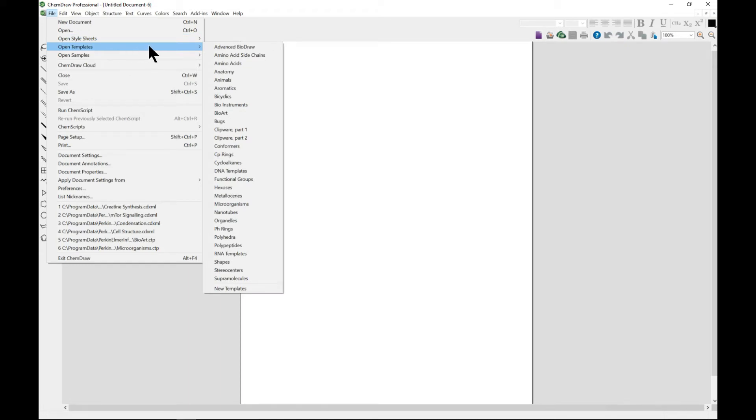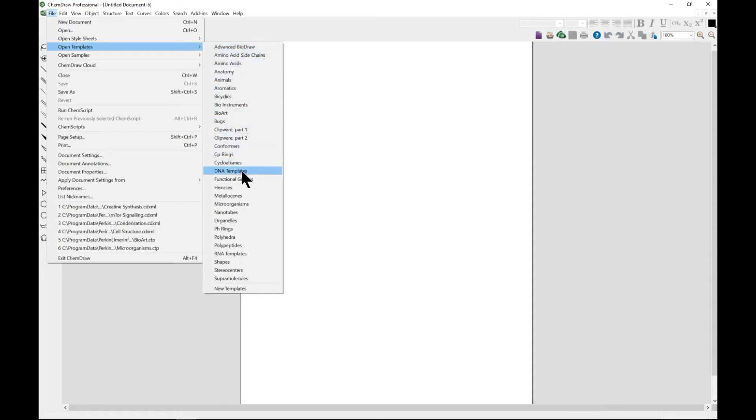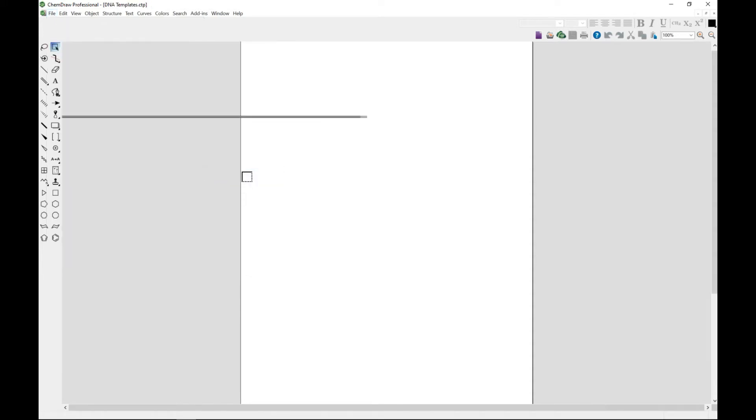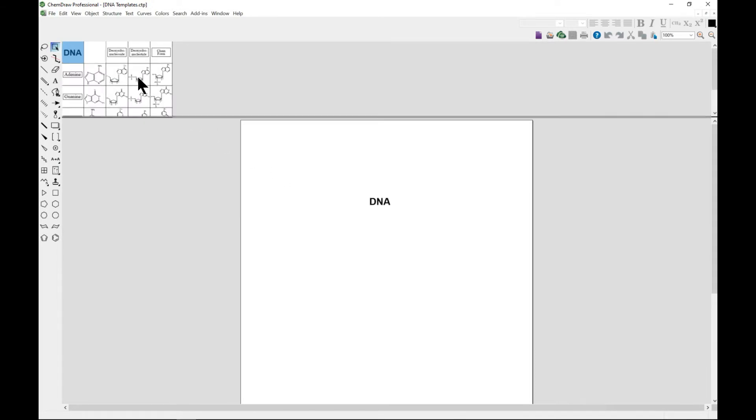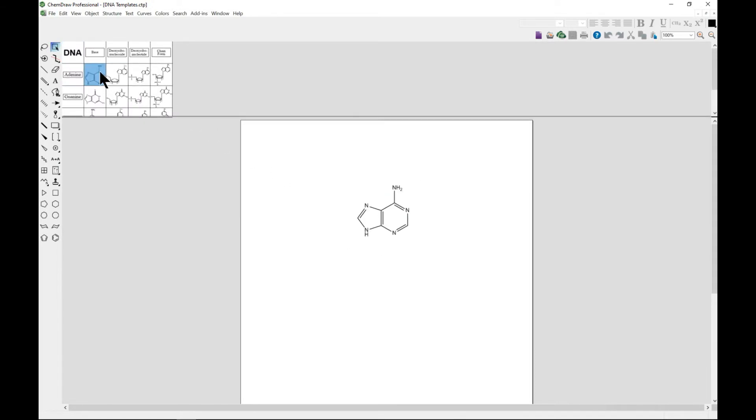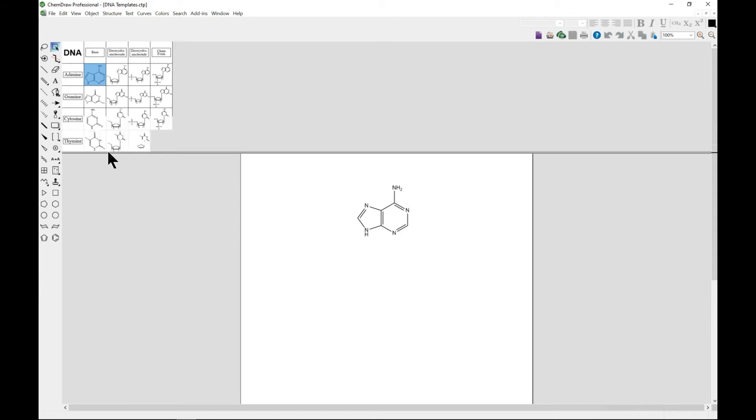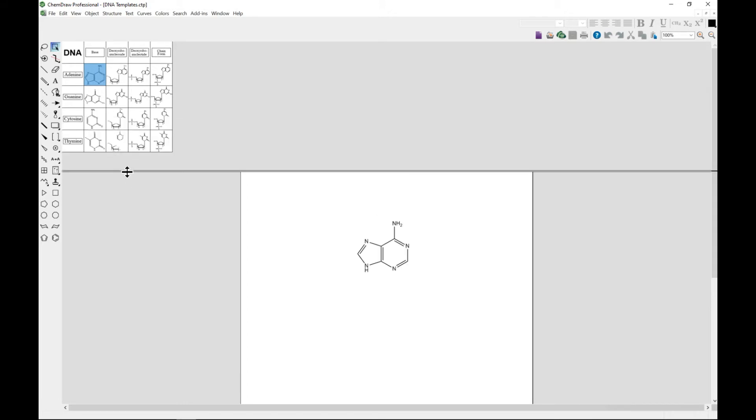These are predefined templates that ChemDraw already provides. If you want to choose the DNA template and from the DNA template you can choose whichever one that you need.